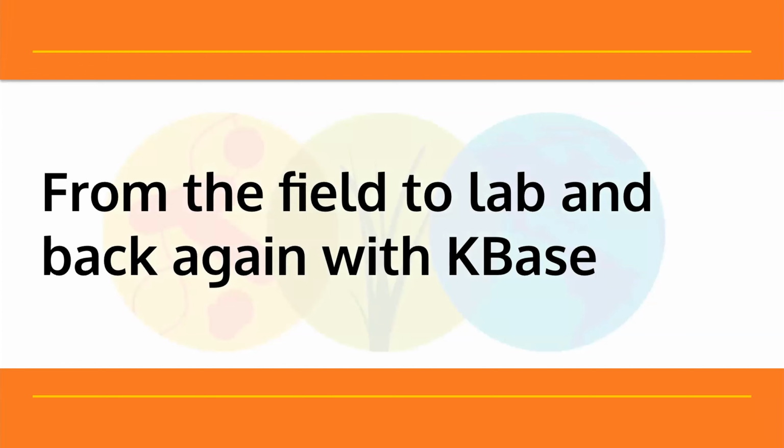So we're going to talk a little bit about this idea that we want to make it very easy for people to go from data that's out in the world, say the field, it could be out in a terrestrial location or a marine location or in the human gut, and translate that into, and integrate it with, laboratory information that gives us a deep mechanistic understanding of the microbes and how they operate, and then move that back again to predict what's going on out in the world.